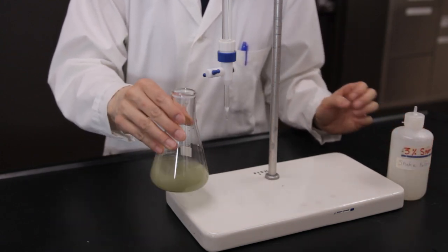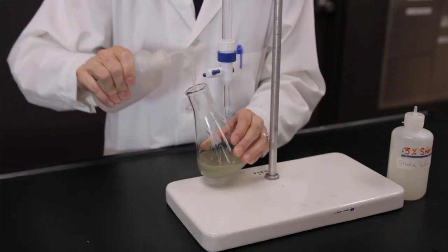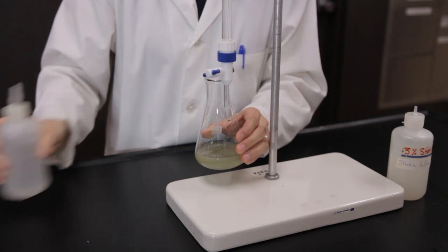The solution will turn to a light purple or gray color. The starch is added in order to help detect the end point of the titration.